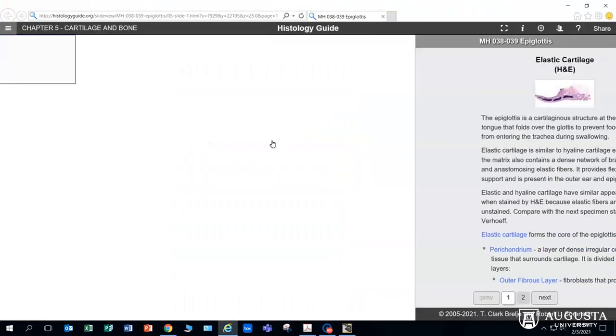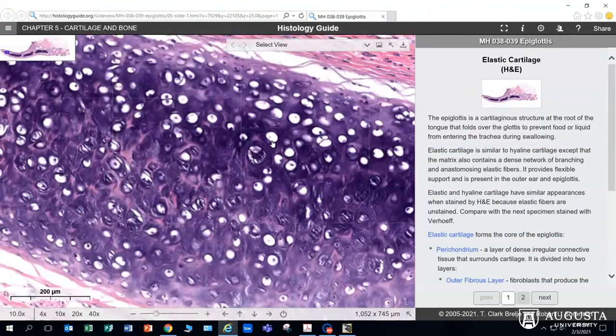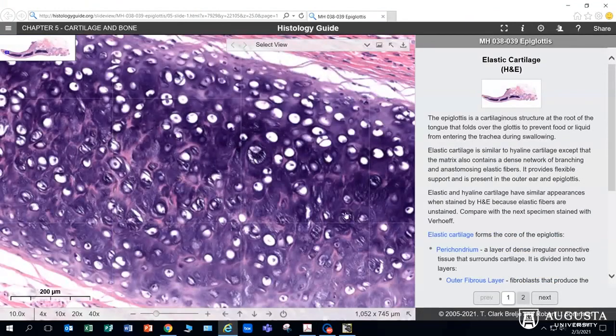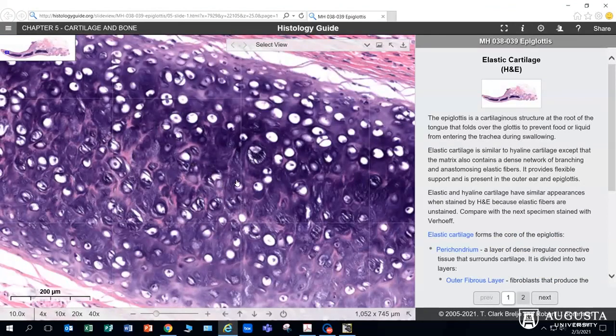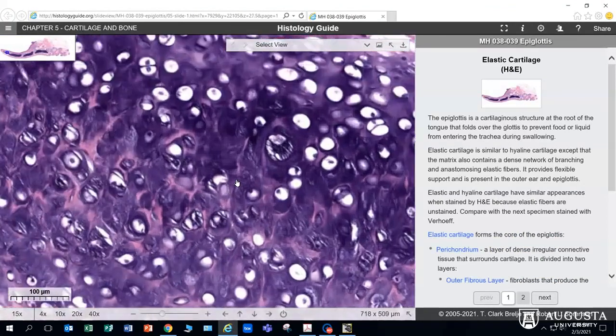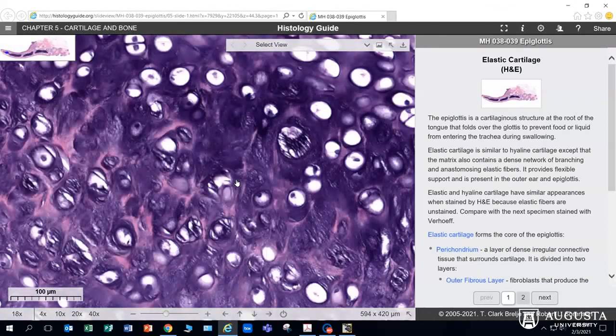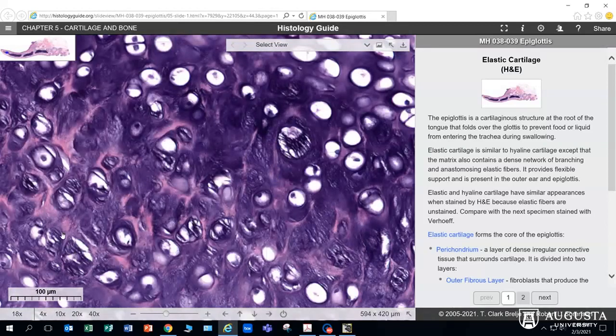So here we have elastic cartilage. We see those beautiful lacuna with chondrocytes inside, and we see elastic fibers in between. So look at all these elastic fibers here; you can actually see them overlapping the lacuna in some spaces.